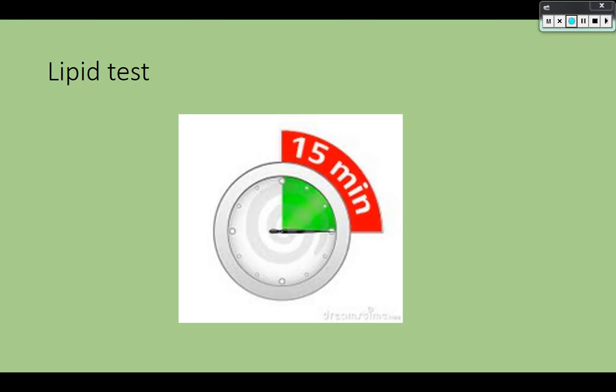And now I need to wait approximately 15 minutes. The way I actually set this up was that I set this up right at the beginning when I came into the classroom. Then I did the protein test, then I did the starch test, then I came back to the lipid test, because really I'm just waiting. Now if I have a solid, instead of a drop, what I would do is press the item between the brown paper until a little bit of liquidy stuff comes out. Whether that's water or oil remains to be seen. But I could take an apple and pat the apple down so that all of that liquid is on the brown paper.